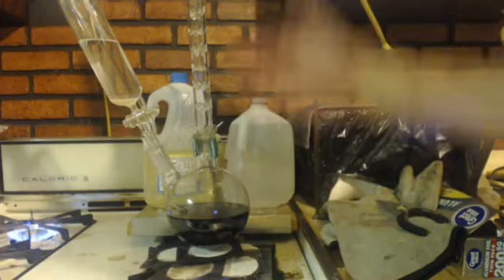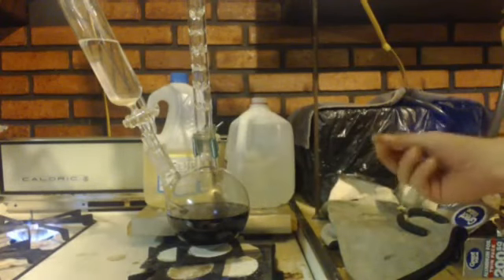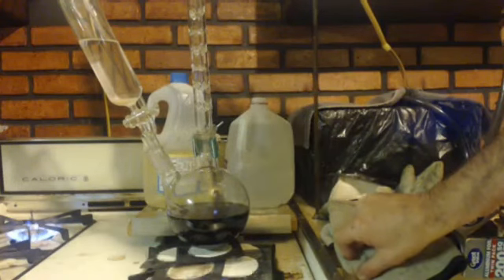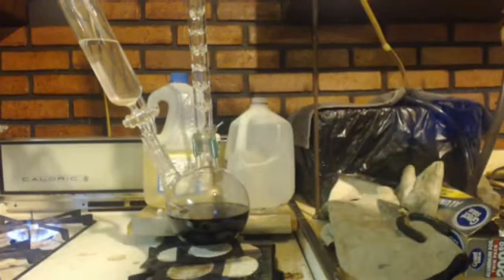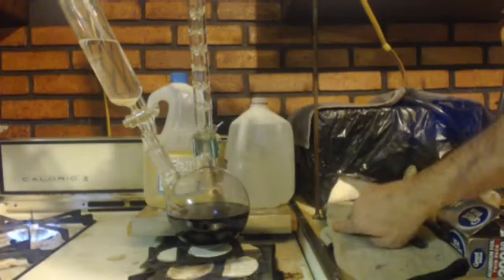When you drip that ethyl bromide into the magnesium, it makes your Grignard reagent, okay? And I already did a video on that, called ethyl magnesium bromide Grignard reagent synthesis, okay? And this is a continuation of that video, because you can't hold your Grignard reagent. Once you make it, you use it. You can't wait for the next day or a week later.